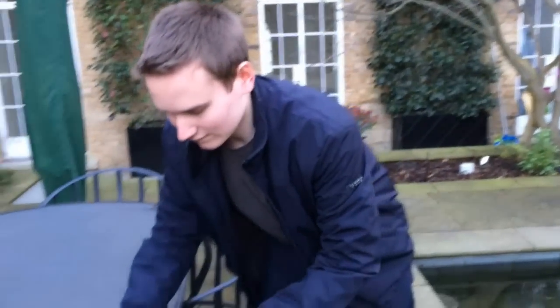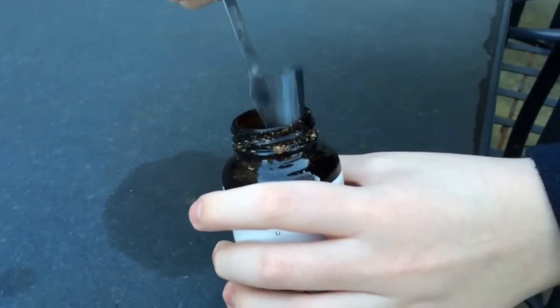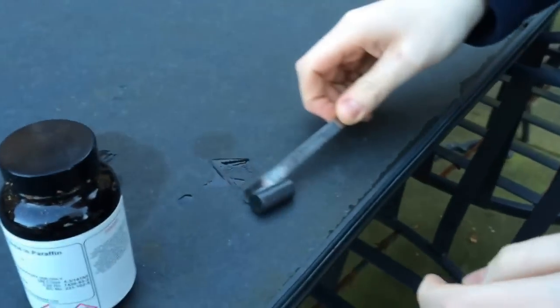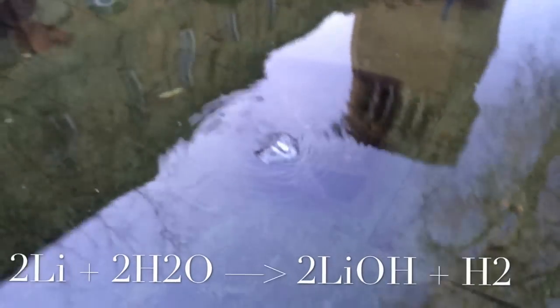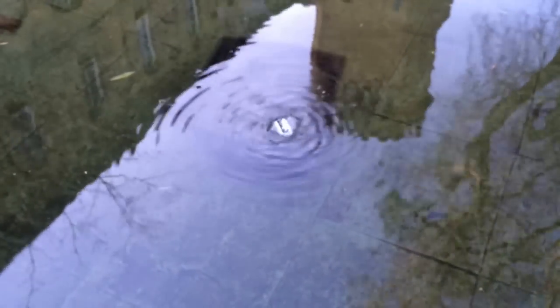Let's start with lithium, the least reactive. Here's some lithium. As you can see, lithium is not that impressive. It fizzes, and that's basically all it does, and produces hydrogen, of course.